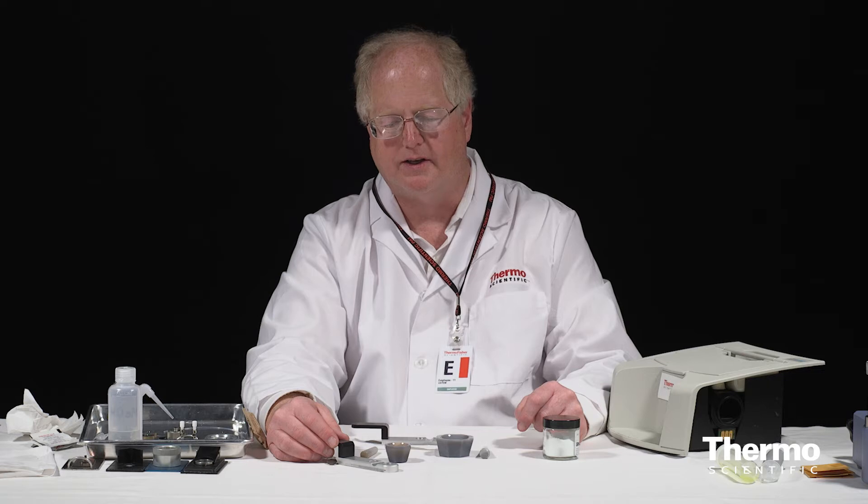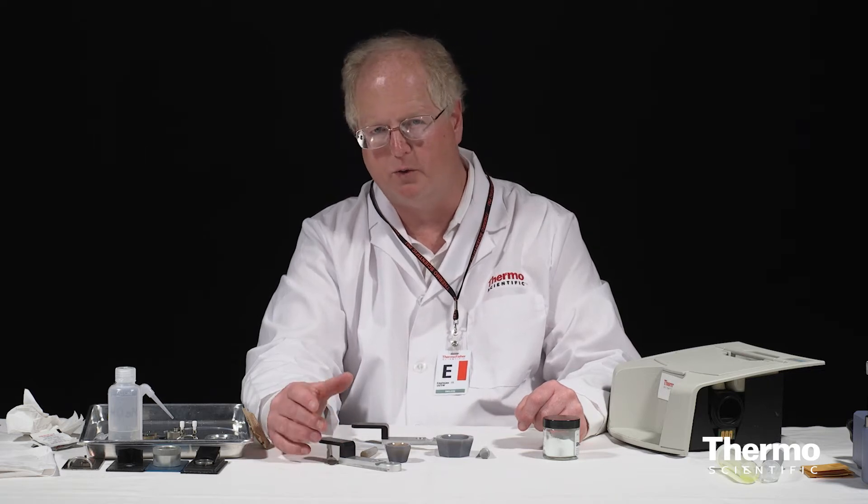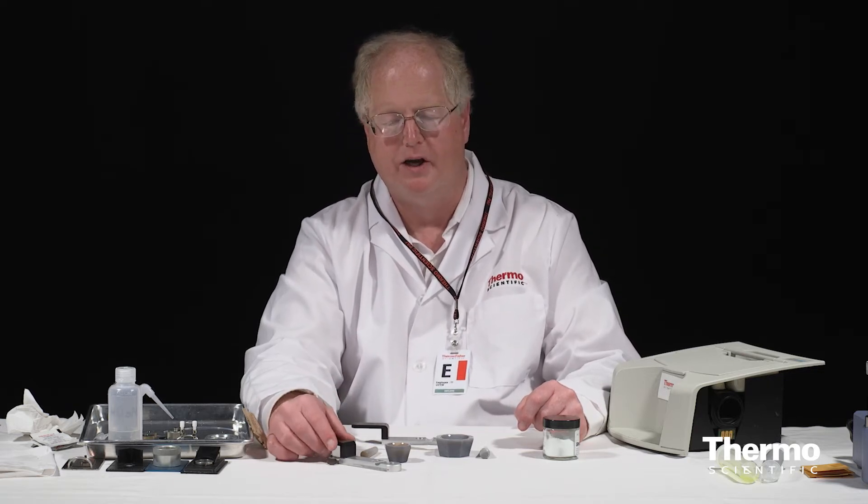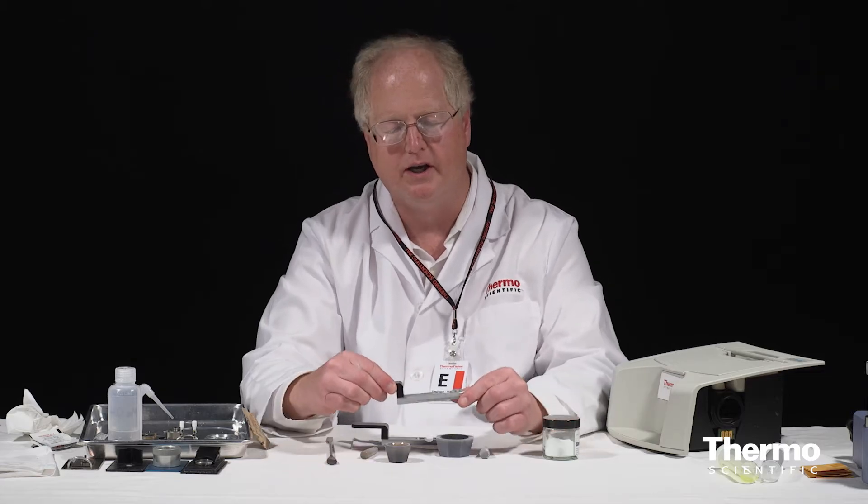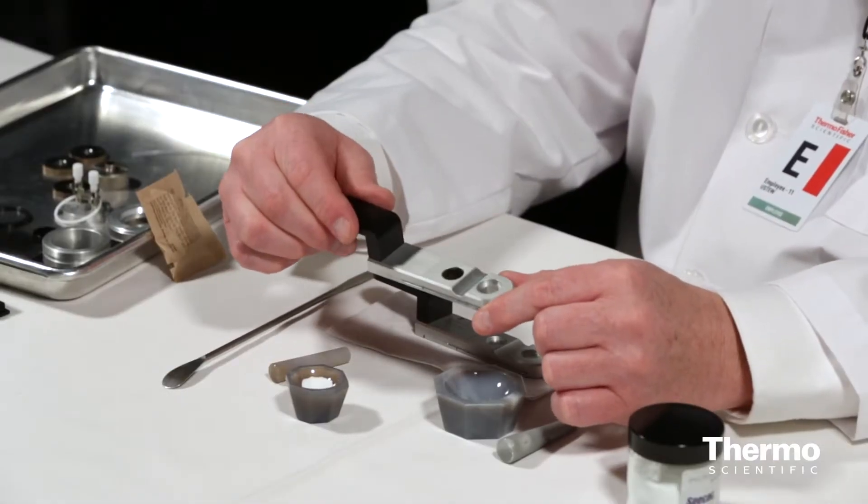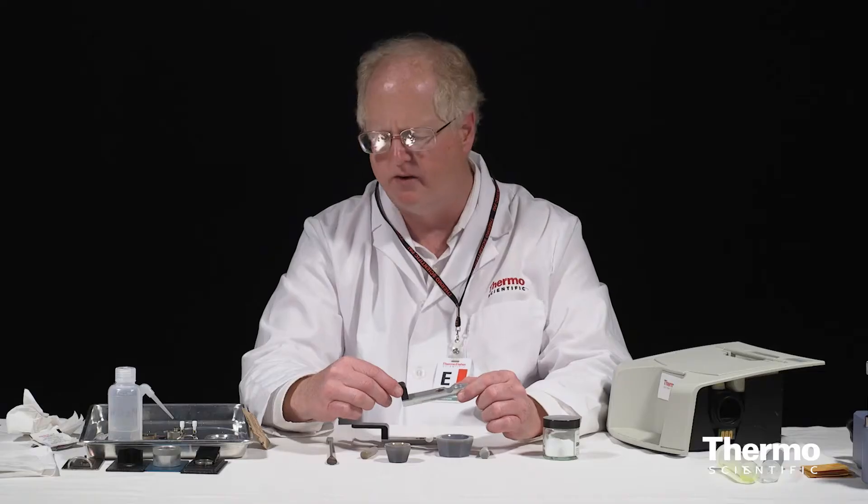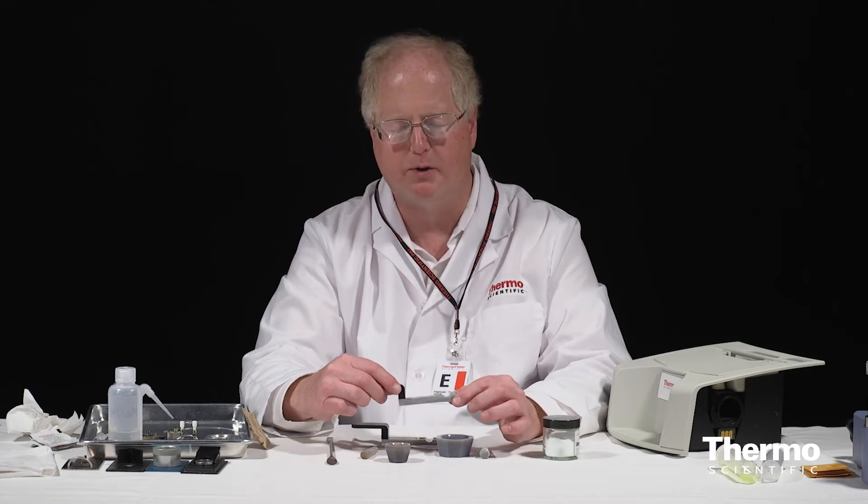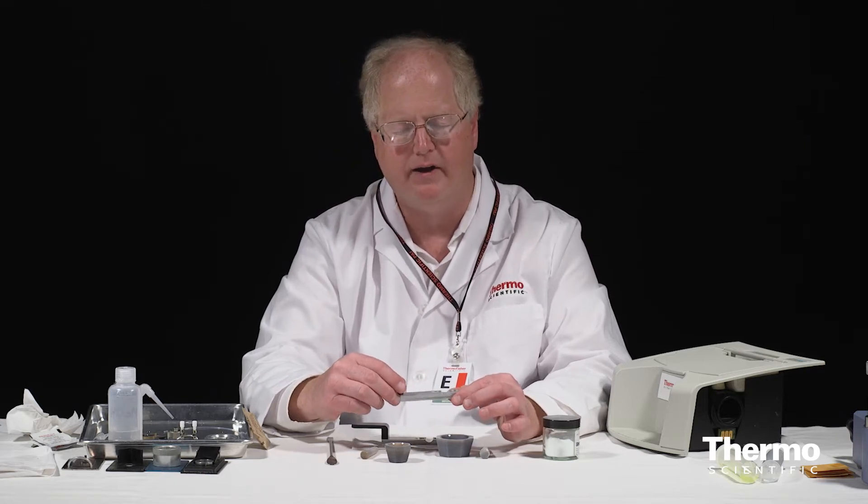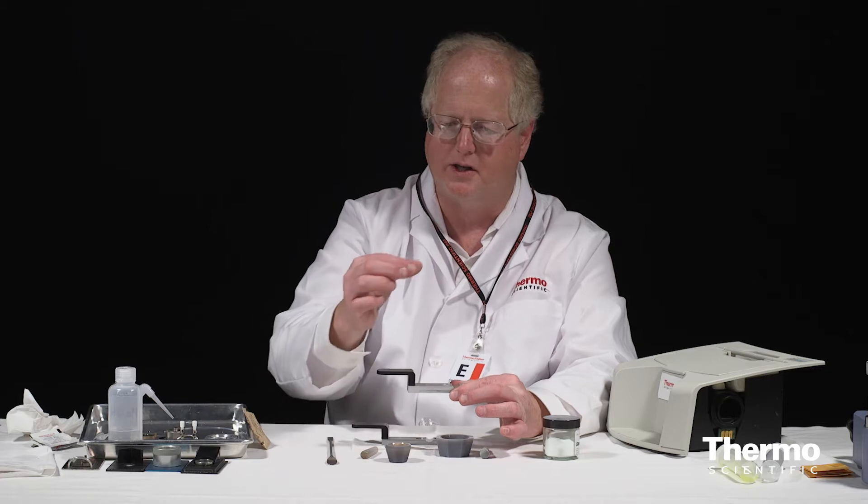For diffuse reflectance sampling, we're going to need to do a little bit of sample preparation. Before I do that, I just want to show this. This is the slider which is going to be used for the sample. Different DRIFTS accessories can be approached in different ways. Some of them will have a slider or something that goes at the top of the accessory and the light is directed down. Others, the sample goes underneath.